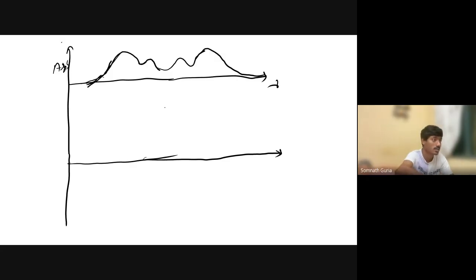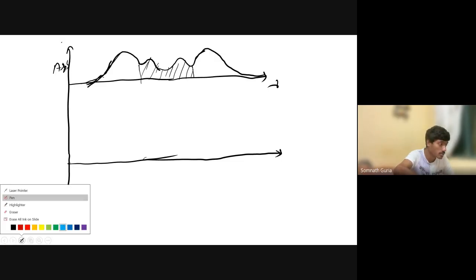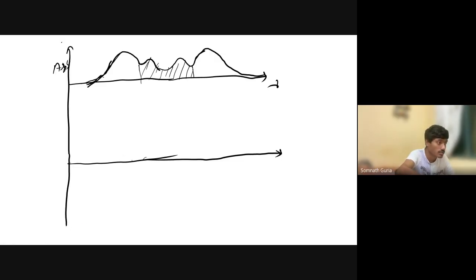Let's suppose over here only this part is active in the CD spectrum, with R and XYZ all over here only. So in the CD spectra, one enantiomer will give us, let's suppose, this.